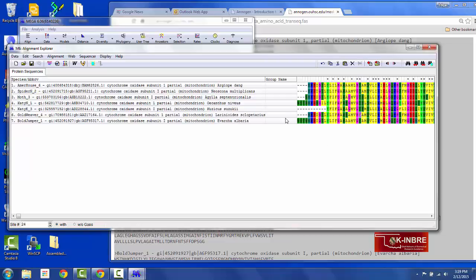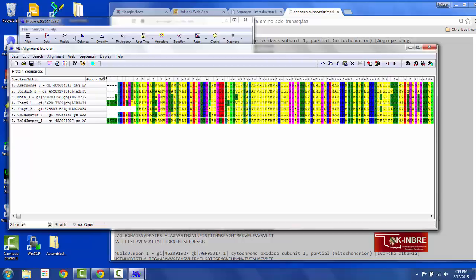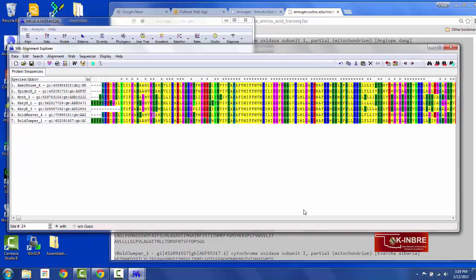What I want to do is actually look at the alignment in a little more detail. So let's go ahead and squeeze this window in, and we'll squeeze this window, and we'll expand this a little bit. So notice there are columns that are complete with identical matches or identical characters, and they're highlighted with asterisks. And there are some columns with some substitutions or amino acid changes. Now, the gaps on the ends of the sequences in our analysis have no meaning, and if these sequences were complete, these gaps would represent an insertion or a deletion event.